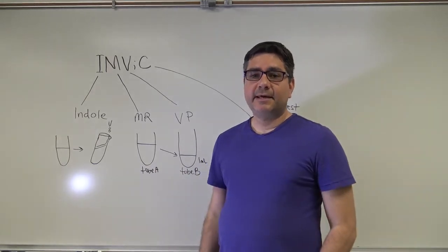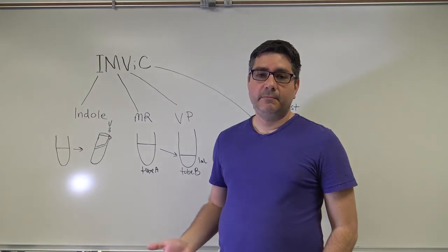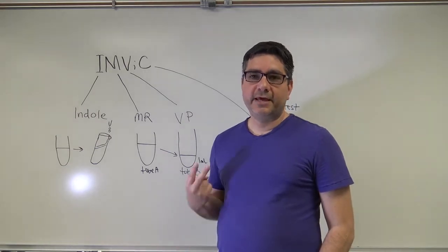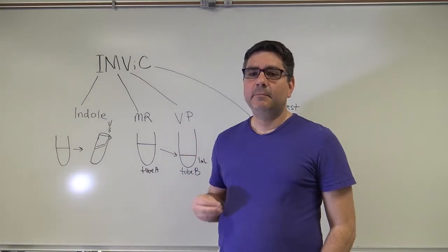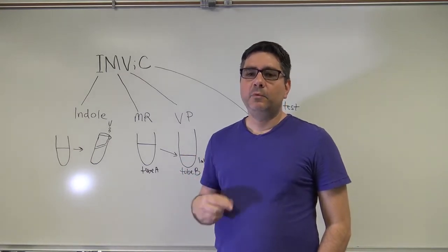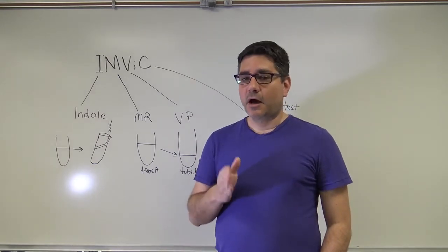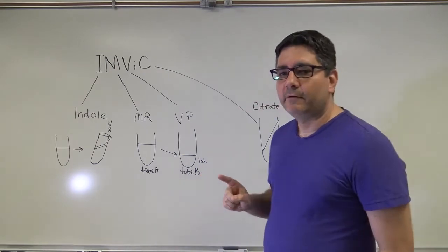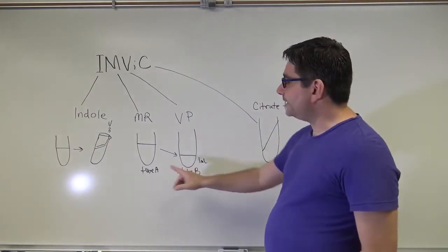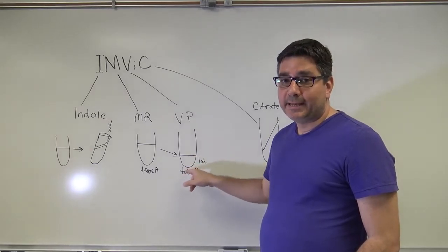This test begins like any other, with an inoculation into the medium, which is then incubated for 2 days. This test should actually be run after 3 days, but due to the nature of this lab, we will check it a day early. After incubation on day 4, you will remove 1 ml of the culture medium from the initial tube, tube A. Place this into a clean test tube labeled tube B.